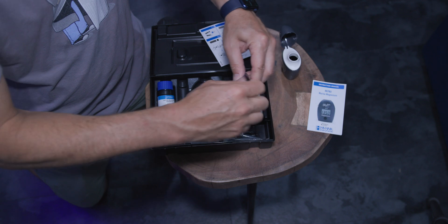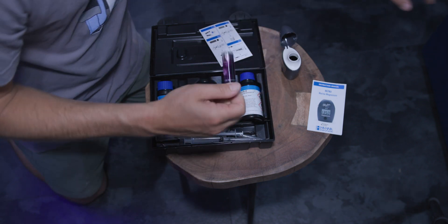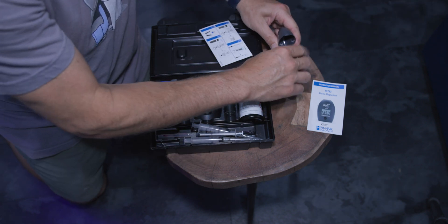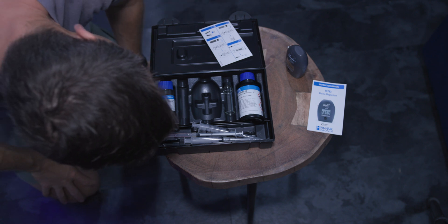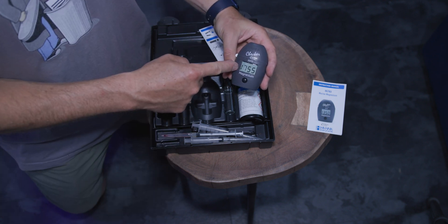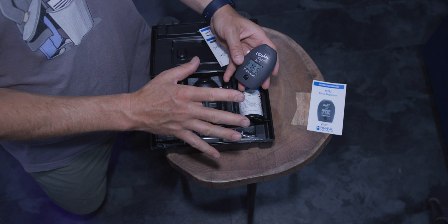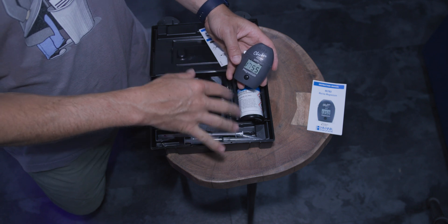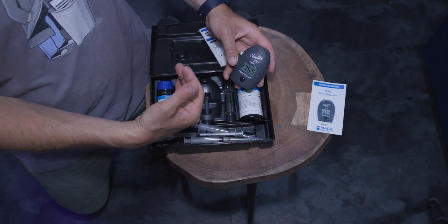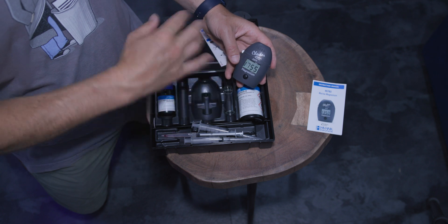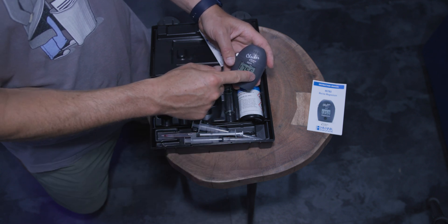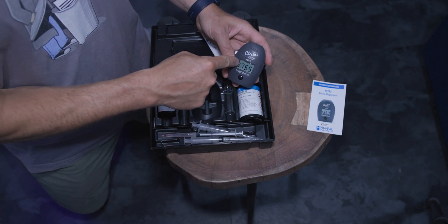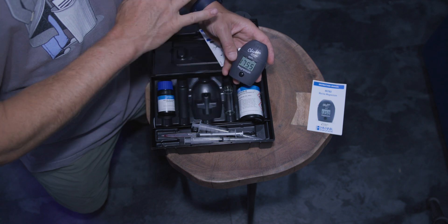Invert five times, it says. Of course, put the cap on. Don't fumble it like I always do. I'm going to invert that five times. I'm going to wipe it down just to be sure. And 1755. Okay, a couple of thoughts. One, I'm impressed that this thing goes over 1500. A lot of tests get stopped at 1500. And if you have higher than that magnesium, you're dead in the water. So, this is telling me it's 1755. Now, I'm going to talk about if that's accurate or not in a separate video, but I like that it will go over 1500. And at this point, the test is done.